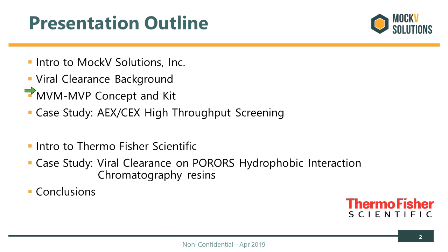I will then introduce the concept of MockV's technology in the form of our MVM-MVP kit, and will then describe a study involving the use of our MVP kit in exploring ion exchange conditions in high throughput screening mode. I will then turn the mic over to John, who will introduce Thermo Fisher and their lineup of chromatography products. He will then take us through a viral clearance study which he conducted involving several POROS HIC resins.